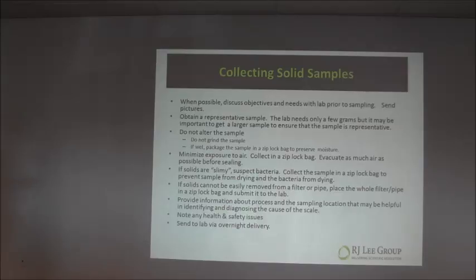It's much better to do that than to take the sample and shortchange them on sample size, or take it in the wrong way, and then they have to consider, it raises some questions that they have to consider when doing the data analysis. You want to obtain a representative sample. These labs don't need a lot of sample. We can do an awful lot of work on a gram or two of sample. Okay, so a teaspoon. We can do an awful lot of work there.